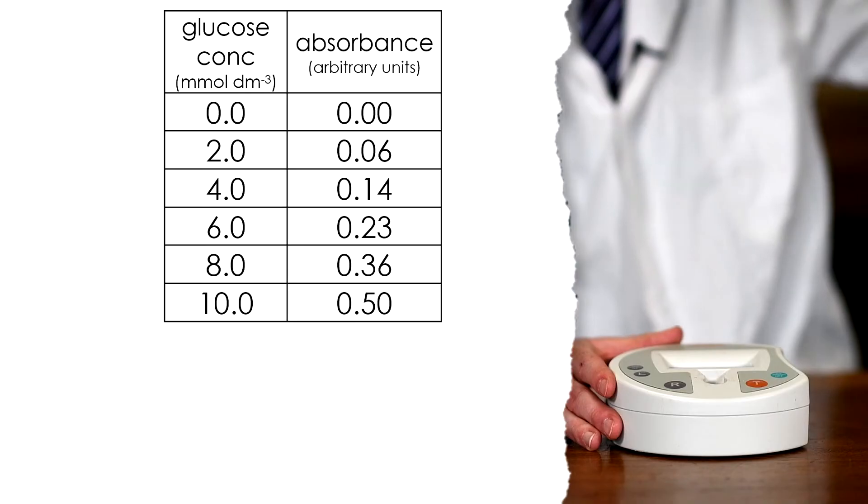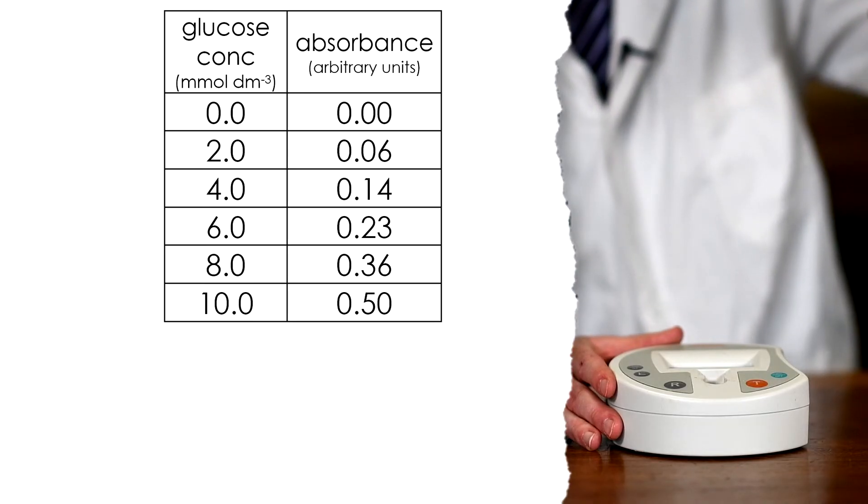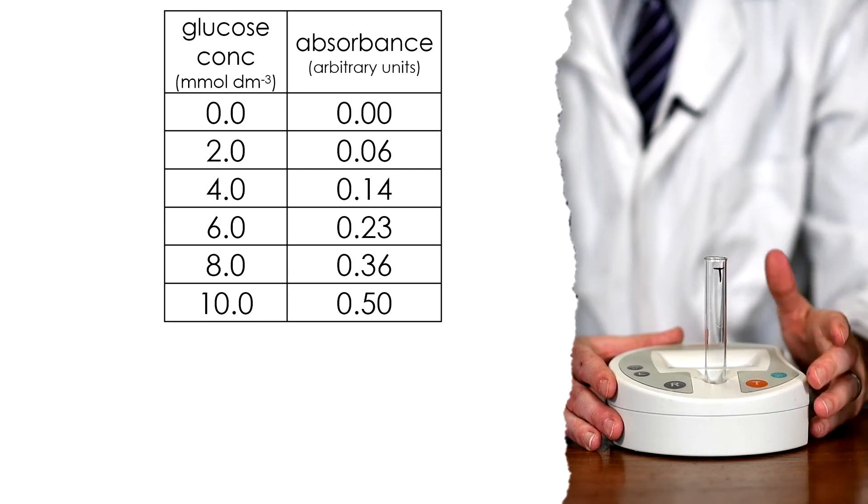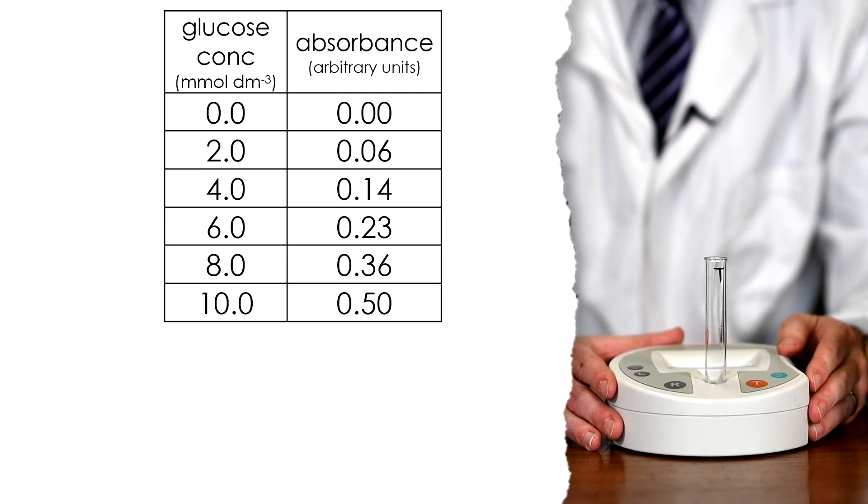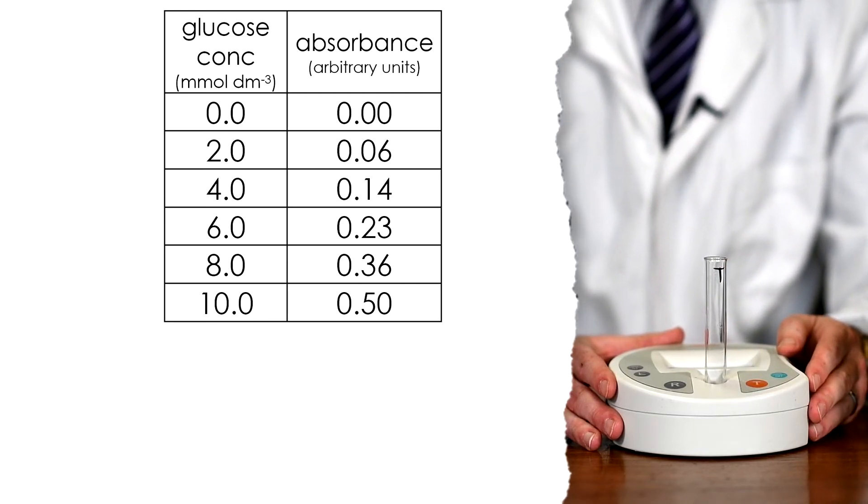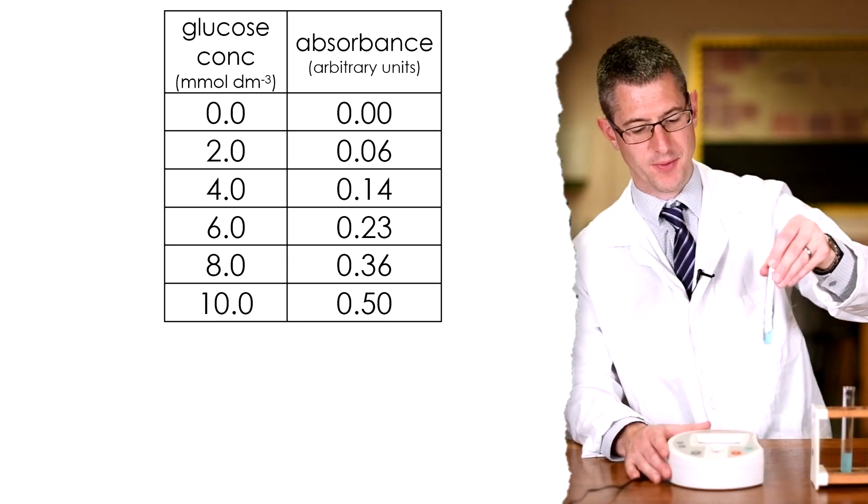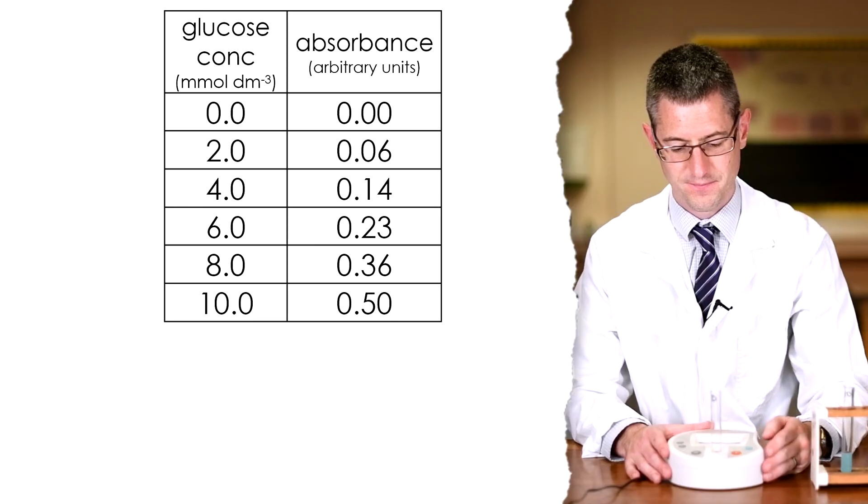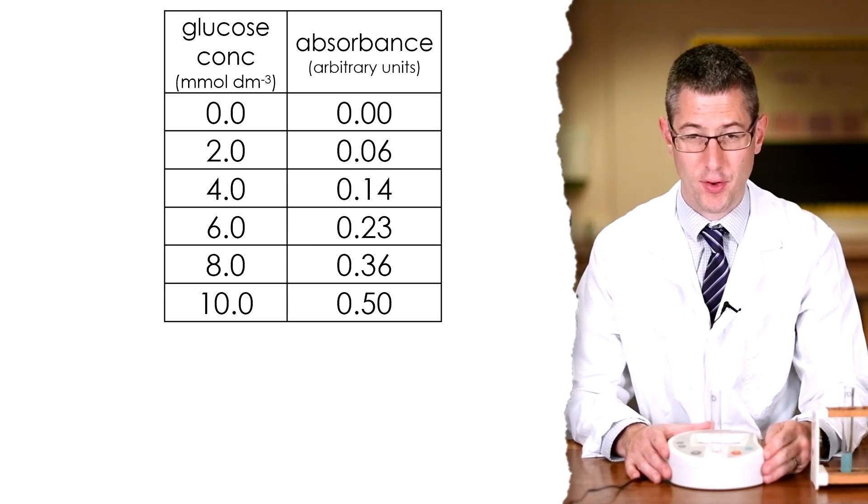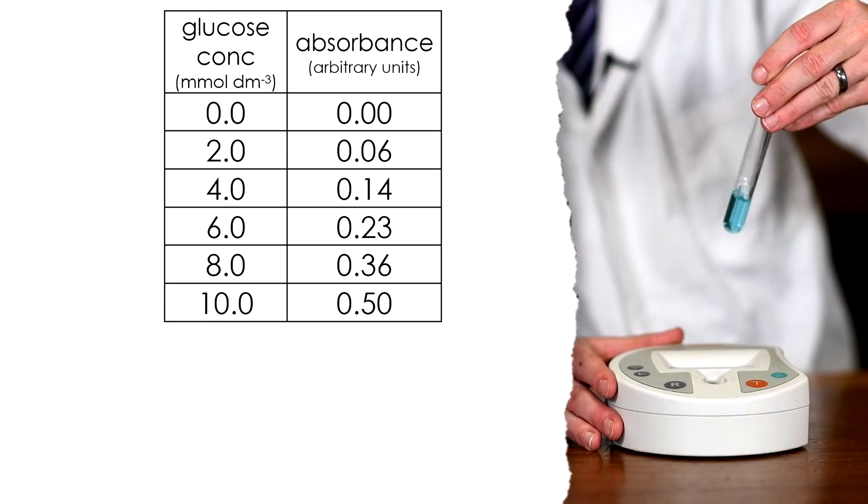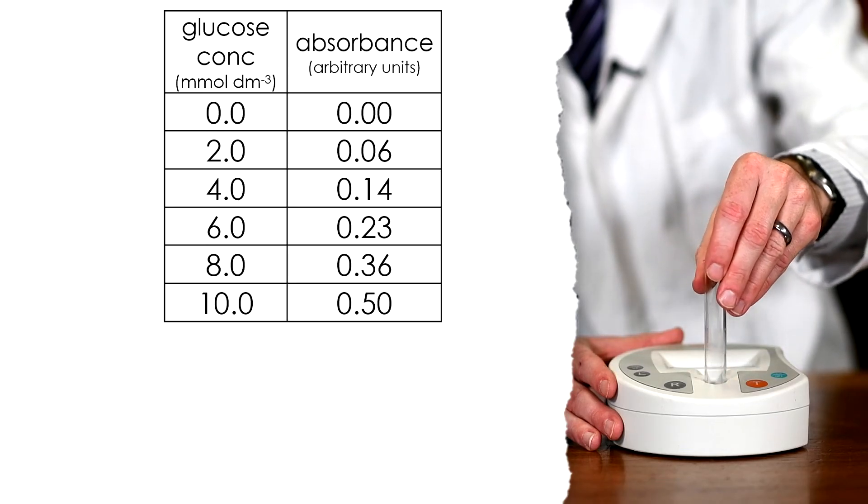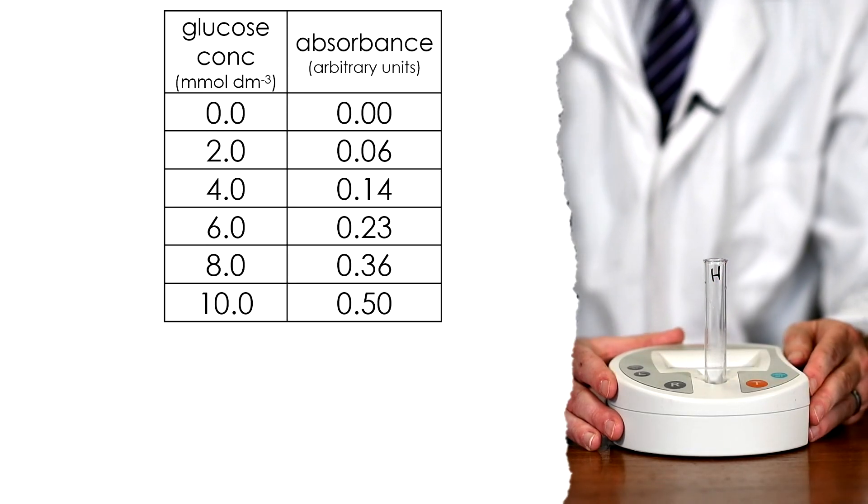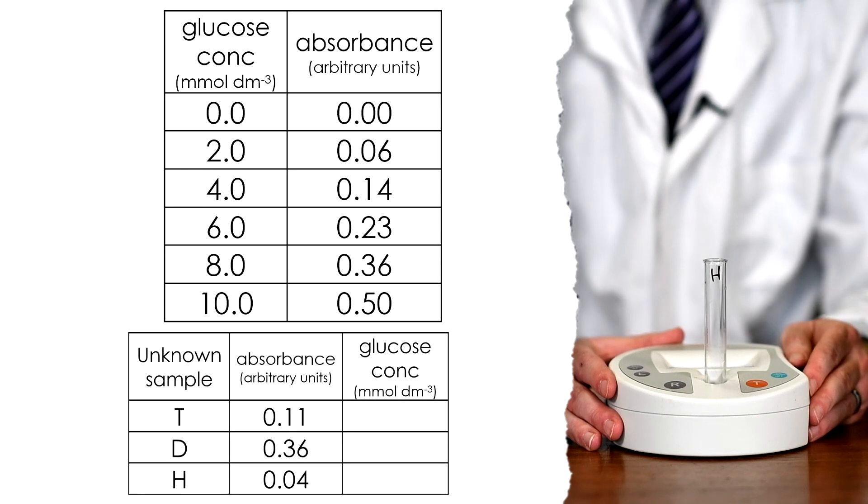I'll measure the sample from Tom. Give it a good shake before we put it in. And the result is 0.11 absorbance. Measure the next sample from Dick, an absorbance reading of 0.36. And finally the urine sample from Harry, a reading of 0.04. So having gained those readings, we'll have to plot a graph of our known glucose concentrations and their absorbance readings.